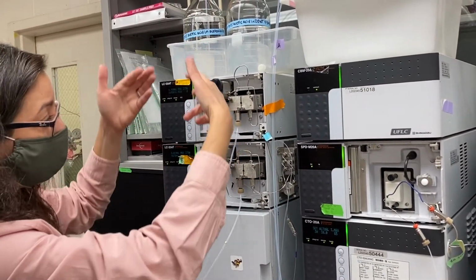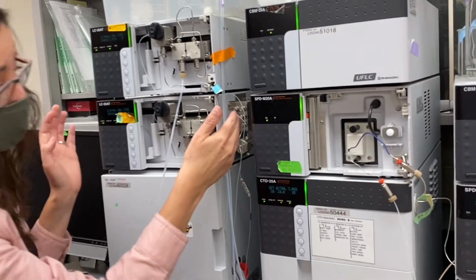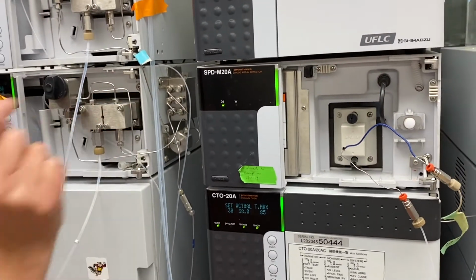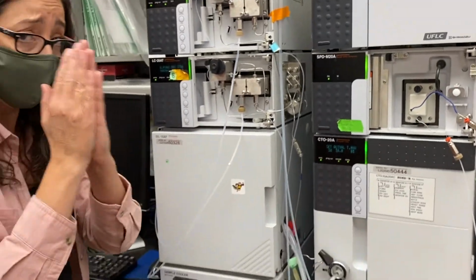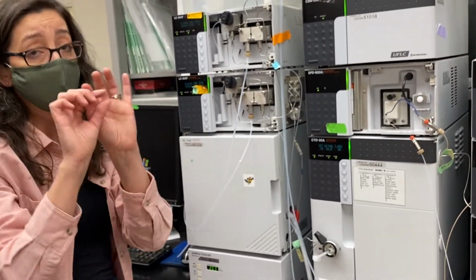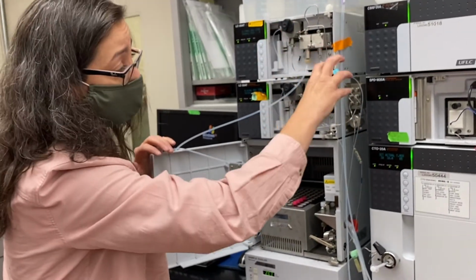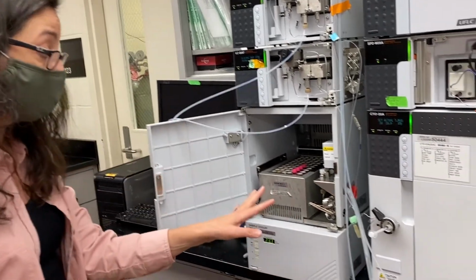And then after both are being pumped into the system, they need to be mixed together. In order to be mixed, we have here a mixer, a compartment where each mobile phase goes in, and then there are channels in there where they're going to meet and get mixed together very well, so you have a very consistent mobile phase. If the mixer doesn't work well, you have a very inconsistent baseline. So it has to be mixed really well. And then the mobile phase, after being mixed really well, goes into the injection port. So you'll see that in action in a minute.